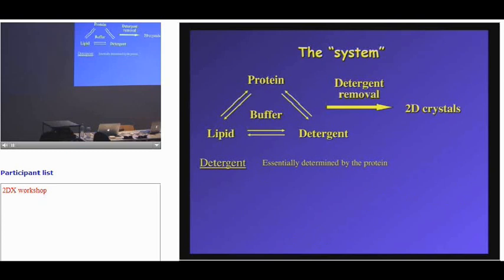So the detergent, as you heard, how much does it need to be delipidated? Oh, that will come. Delipidation, I don't think this will come. This is a good question. So how much should the protein be delipidated? If the protein actually survives complete delipidation, that I think is the best thing to do, because then you can very precisely get the lipid to protein ratio artificially by how much lipid you add. But it depends obviously; if the protein dies when you remove the lipid, you have to keep it. And so that becomes very tricky.